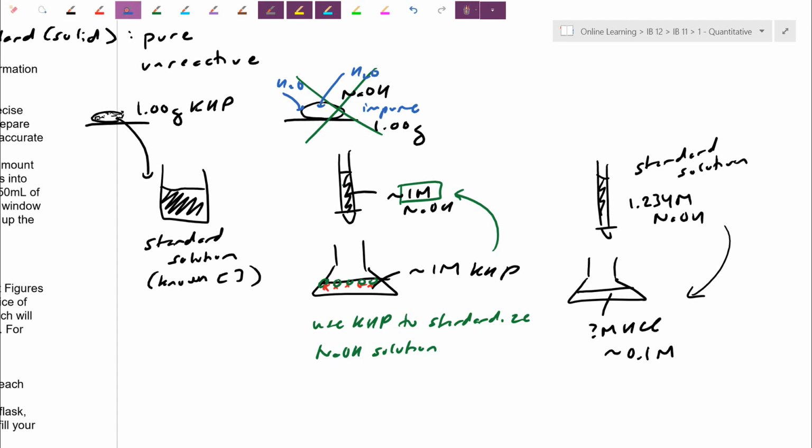So let me just demonstrate this for you on the virtual simulation. We'll switch over to that. So this here is our virtual lab environment. I'll do another video on how we can download the software and how you can access these solutions. Assuming that you've done that here, on our OneNote so far, we've been looking at the problem description on our handout. You can actually access that description here.